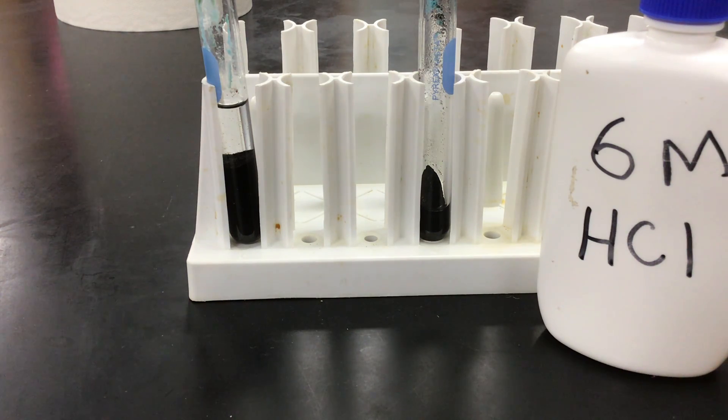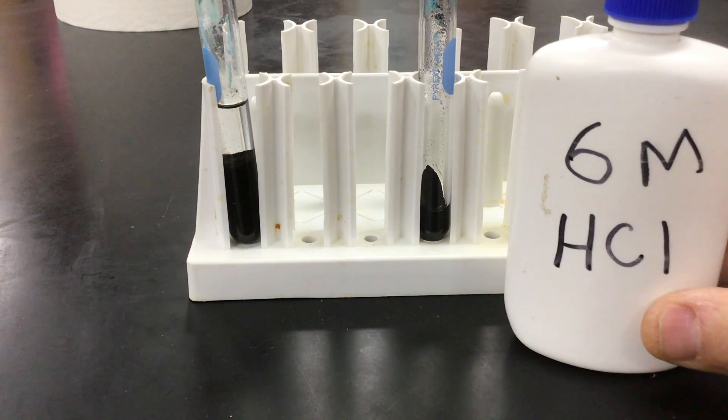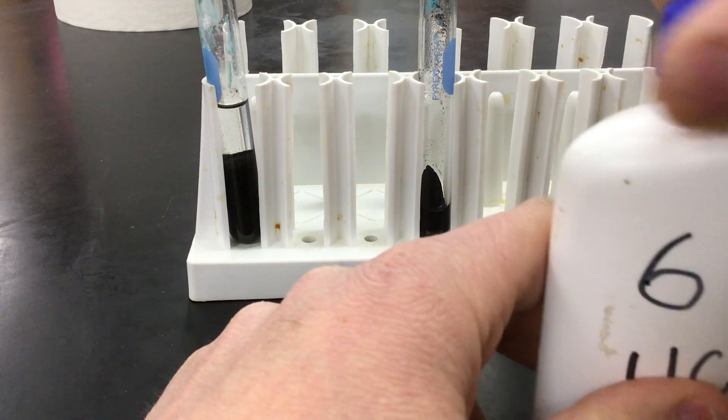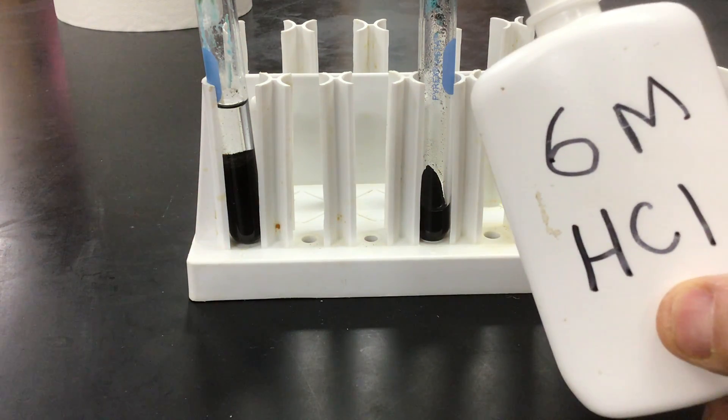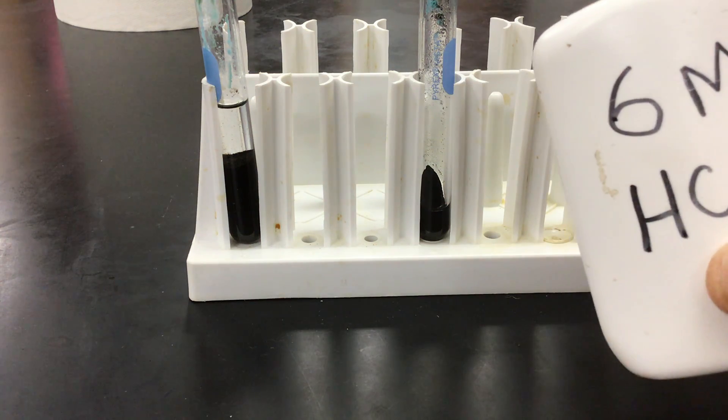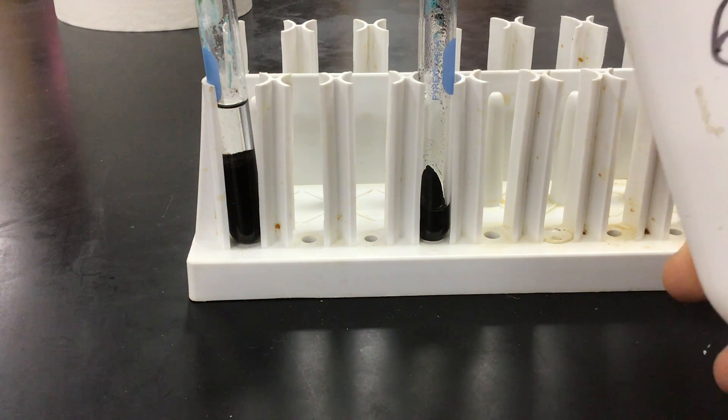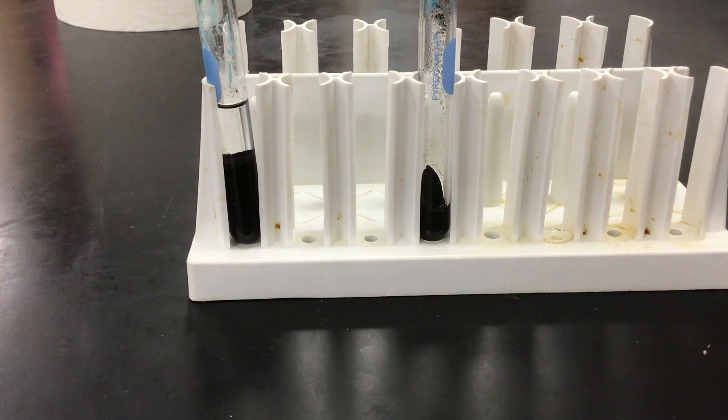So now in step four, after cleaning the precipitate, we are now going to add six-molar hydrochloric acid. Six-molar hydrochloric acid is an acid, it's aqueous. It's an aqueous solution, and it is colorless. So we have a black solid and a colorless liquid.